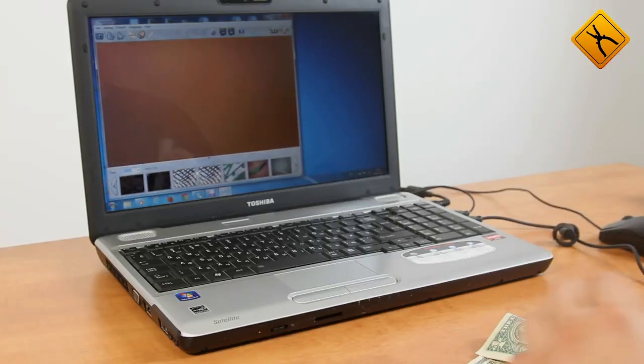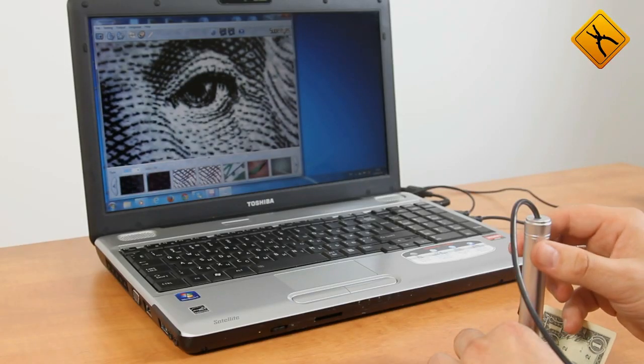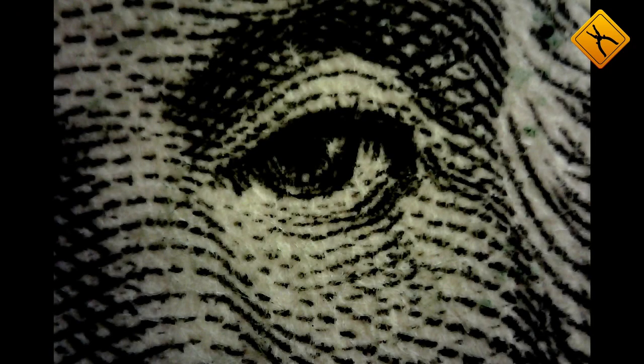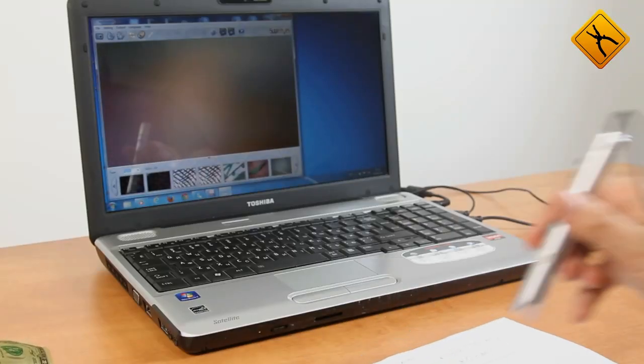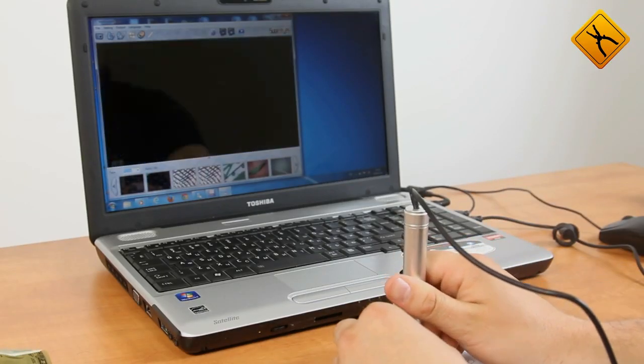Now, let's take a closer look at Mr. George Washington. And now, finally, let's look at a sheet of paper with some writing on it.